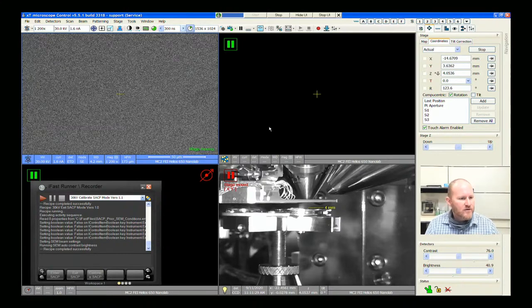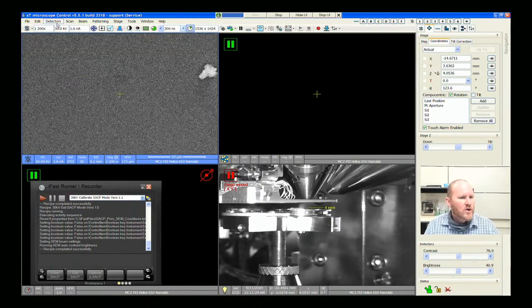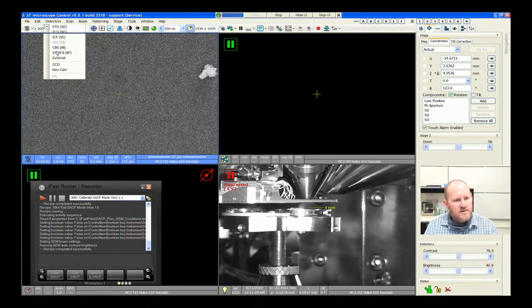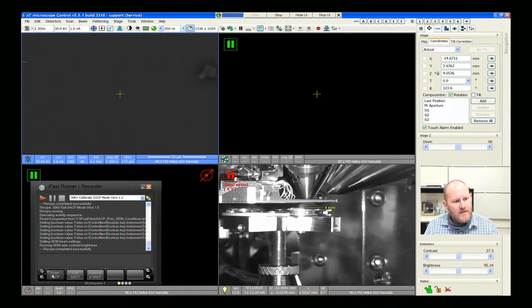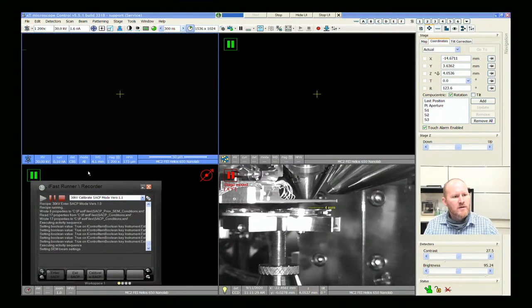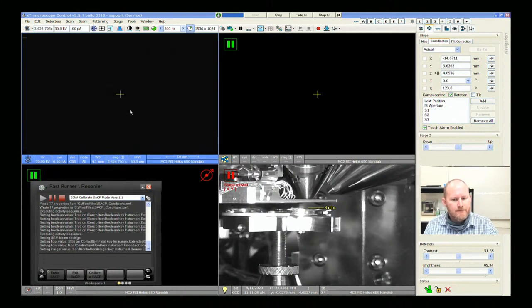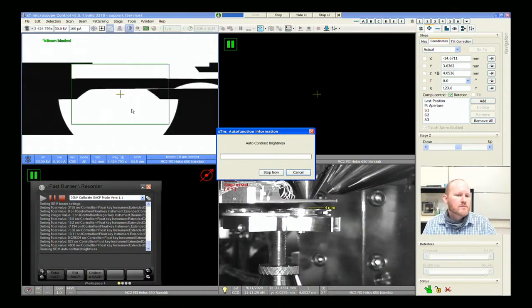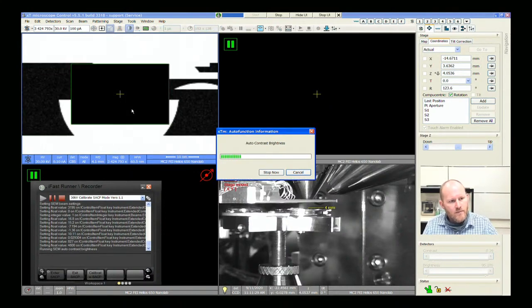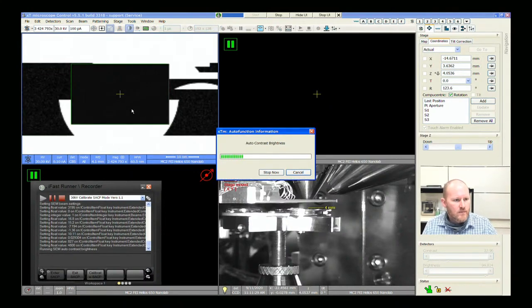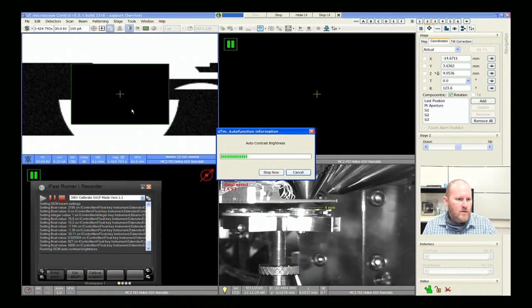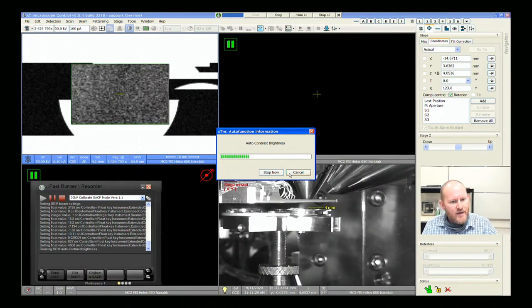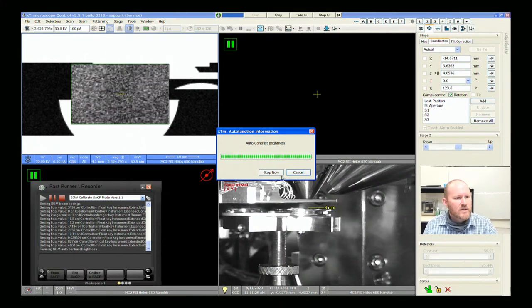Let me go to the next silicon wafer. If all goes well, we should be able to go to our CBS detector, enter SACP mode, set our contrast and brightness, and then see a pattern. We've talked in the past about pulling out this ACP routine, which we can do.